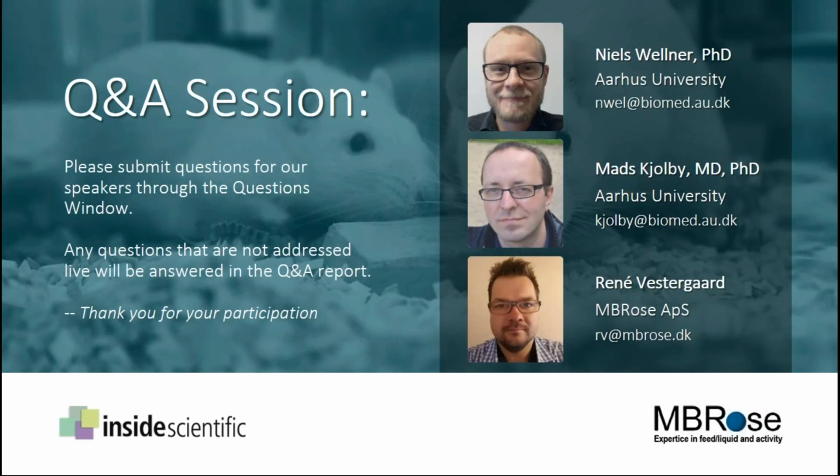Okay, perfect. And Niels and Mads, maybe along the same lines, I know you mentioned it, but maybe you can elaborate. How can a user be sure that individual water and food intake is accurate given that there's going to be spillage and evaporation? Can you just repeat and highlight what you had said during your presentation?